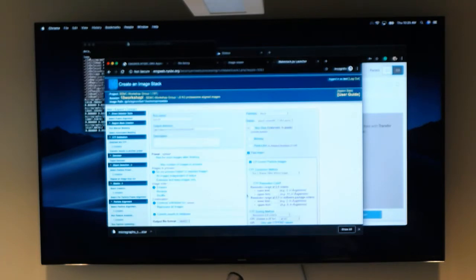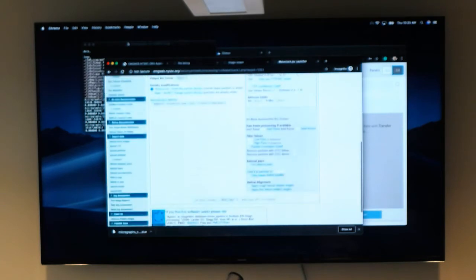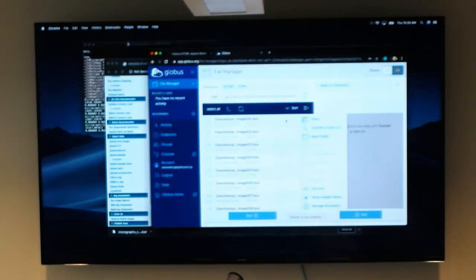Don't forget to add a description. You can skip this and only select create EMAN box files and run that. So then that is how, when I went over here, I created a stack run, in this case stack 3. These box files are populated. So these box files are matched to the coordinate picks that we picked in Appion Part 1.